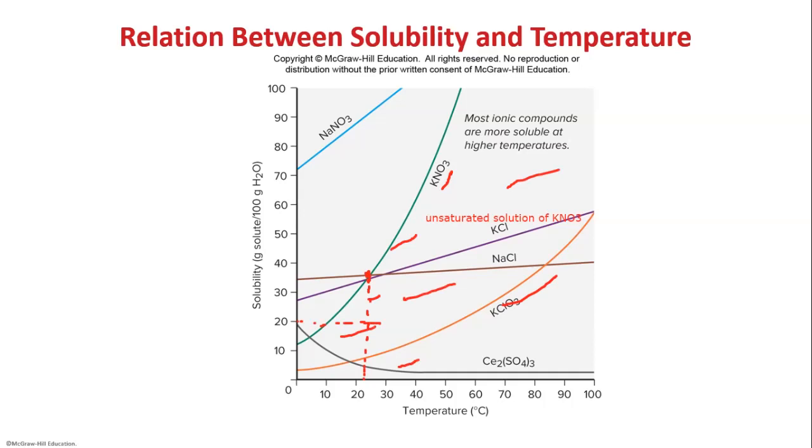Now on the line, this is a saturated solution of potassium nitrate.